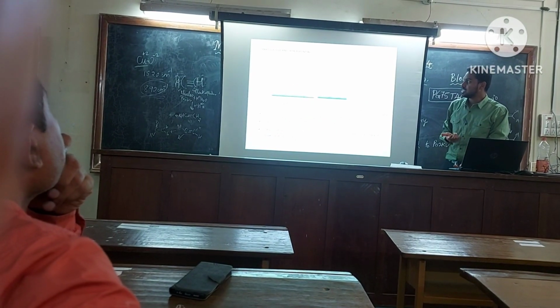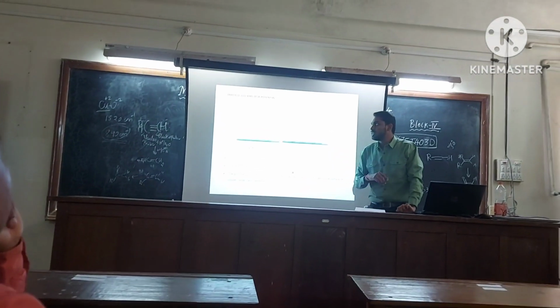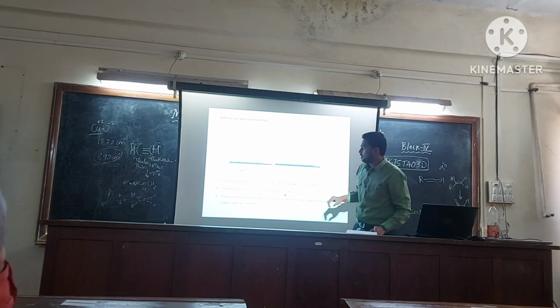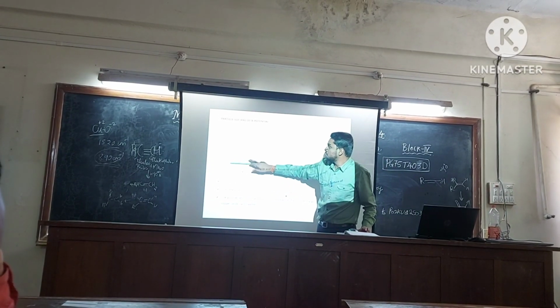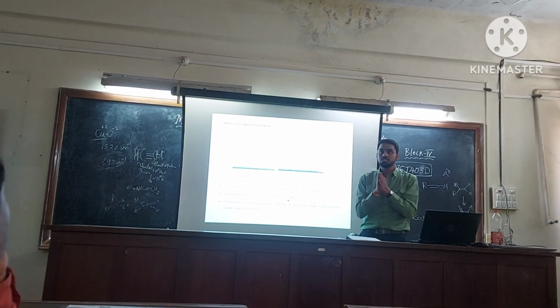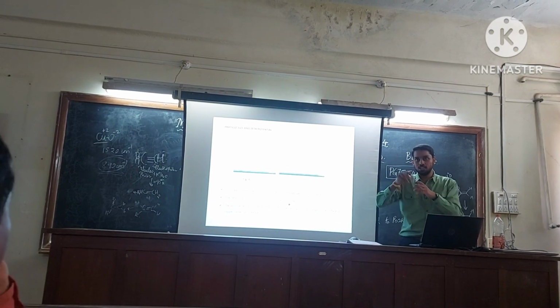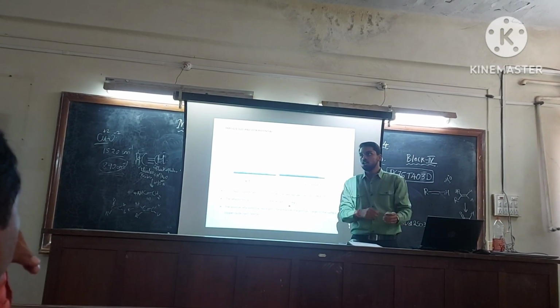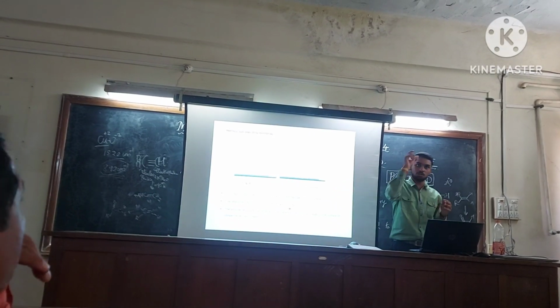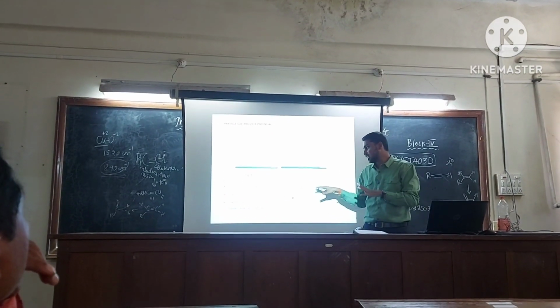So this is the particle size and zeta potential. Particle size is basically used to measure the diameter. Whenever we talk about nanoparticles, we say the average particle size. We never say the particle size of a particular structure. We always say average, because all particles will not be of the same diameter and size. Some will be small, some will be large. So because of that we take the average and we get one value.